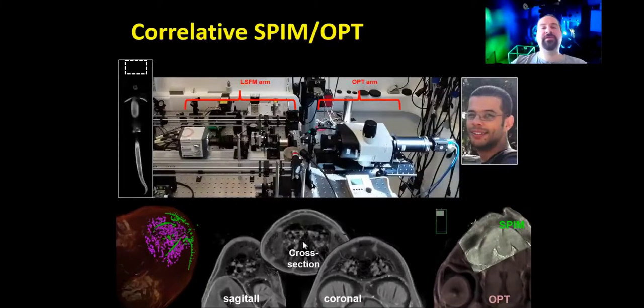And here, representing the tip of the snout of this shark embryo, you can see that you can get fairly good resolution with optical tomography. These are images of optical tomography, and they're fully isometric. No matter which angle you look from, which plane you're trying to reslice your sample, you always get the same kind of detail. For more detail, we can resort to SPIM light sheet illumination, and then you get even more detail, and that's what we're working on.